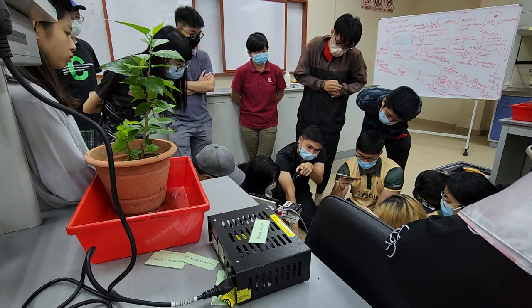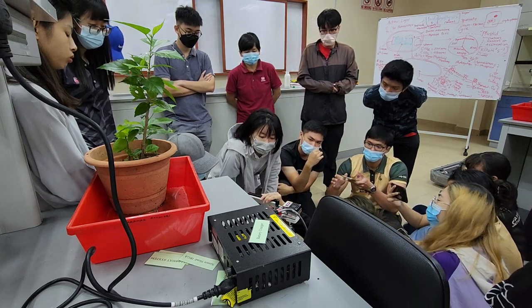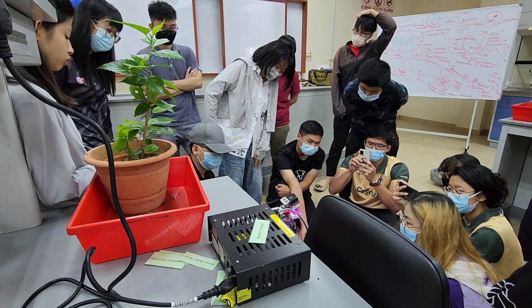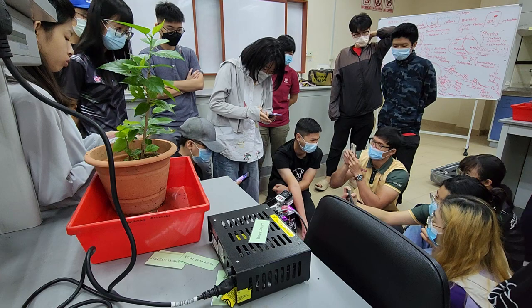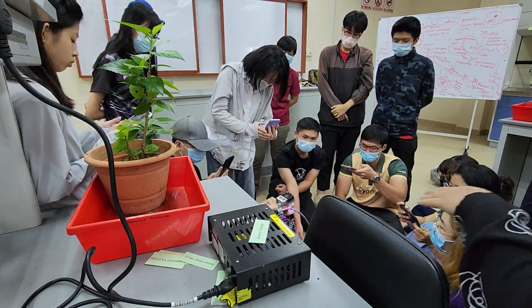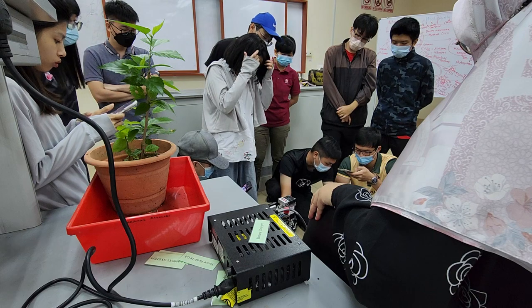Okay. So you can turn on the LED lamp. Press here. The handle. Yeah. Belum lagi. Open up. Yeah. Memang tak boleh lah. Battery. Do you have light? Yeah, so that is the battery ada masalah? PAR battery block. Kan ingat tak itu? Kita kena guna bateri yang betul baru dia okey. Bateri ni ada masalah. Bateri mana hari tu? Madi ni memang tak boleh. Maksudnya bateri ni yang so now everything is good. The RH is dropping. So you just bypass it lah. Bateri mana lagi yang nampak macam okey?